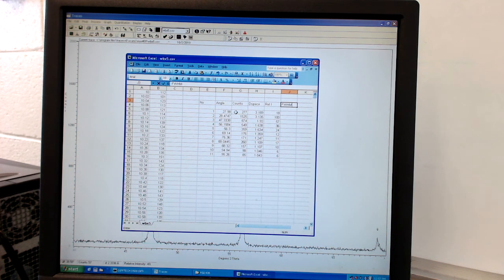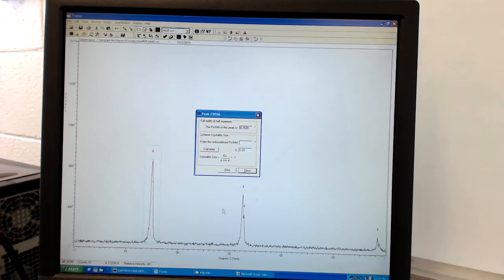This was the 47 peak, so that was 0.2520. It's all right there. So you might also see the full width half max, and we have to do that individually for each peak. And so that's how we're doing it in these cases. So chances are that's how the data is going to be given to you, the information that comes to you in this CSV file.